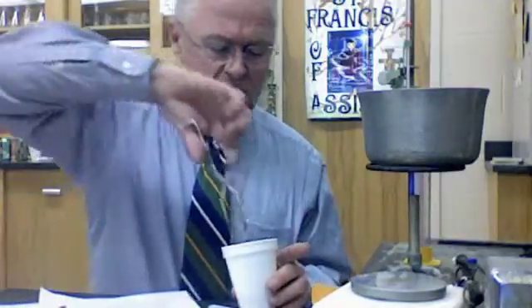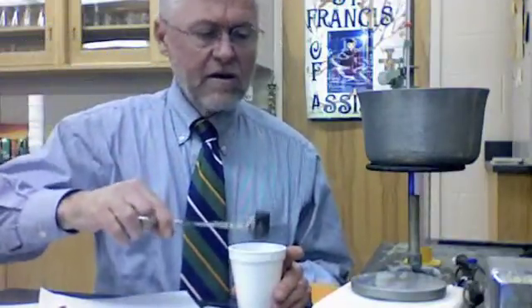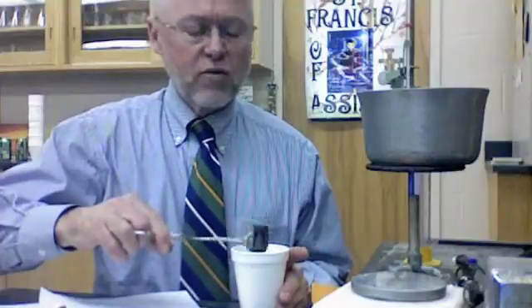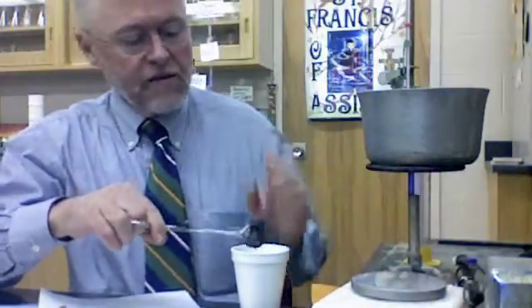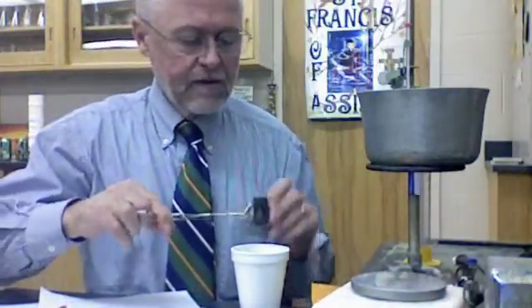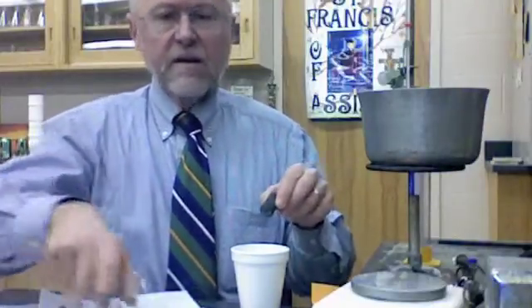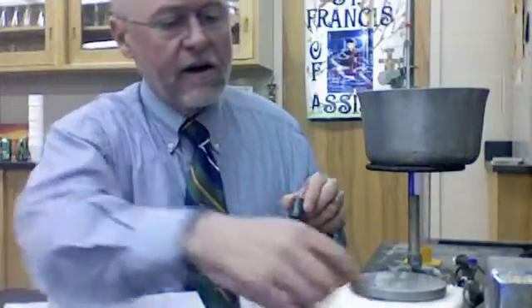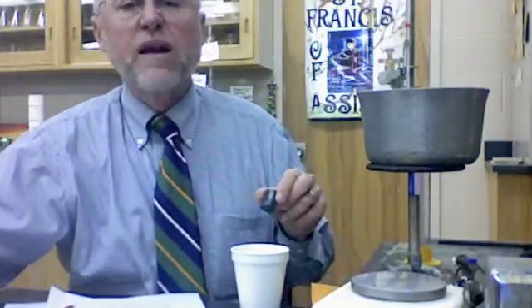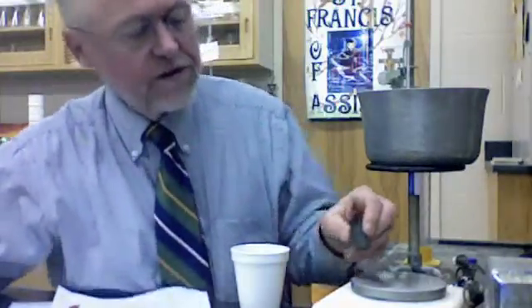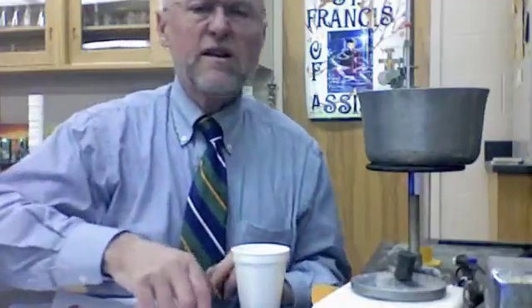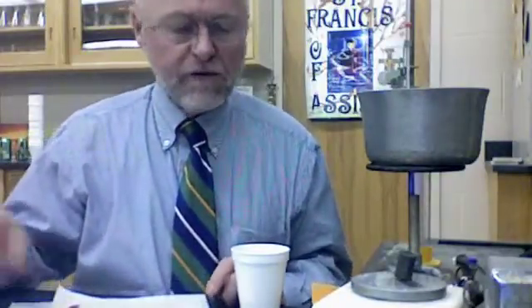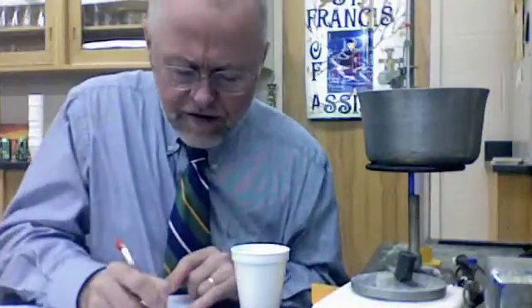Now I do need to get the mass of the metal. That's the mm. So I'm going to just take that and put that on the balance here and find the mass of the metal. Got to get my balance on. Sorry for the delay here, but there it is. So the mass of this piece of metal is 50.95 grams.